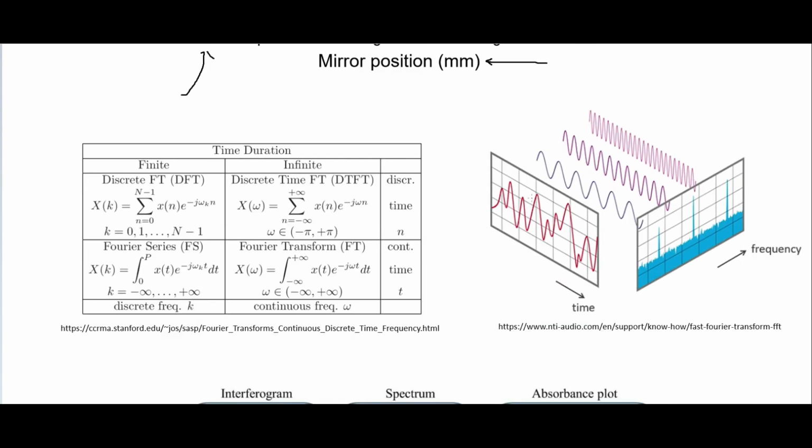I'm not going to talk about what that all entails here. I do actually have videos where I go into some more detail about that in my crystallography and in my cryo-electron microscopy videos. But what we care about for our purposes here is that we have this time domain, and so we can do a Fourier transform and put that into the frequency domain. And so the frequency, as I said, is proportional to the wave numbers.